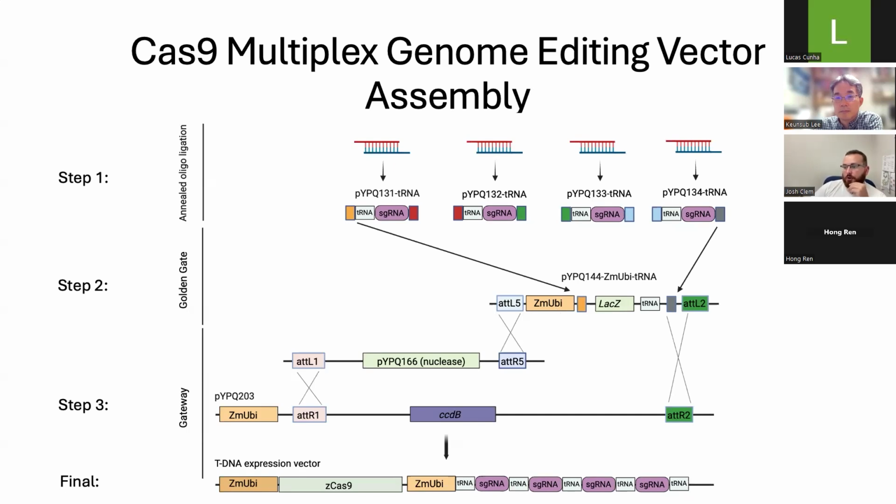As I said before, I've assembled up to 8 using this system. While there is some reduction in cloning efficiency as you scale up the number of guide RNAs, it seems to be efficient in the sense that you don't have to screen much. You can really screen 1 or 2 colonies. We also couple this with blue-white screening, so we select the white colonies, and it's not uncommon at all to have only maybe 1 or 2 blue colonies on a plate full of colonies. So I would certainly recommend looking into this system if you're interested in expressing multiple guide RNAs under a polymerase II specific promoter.